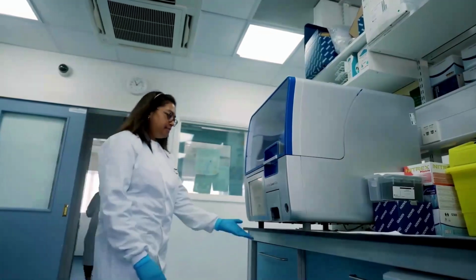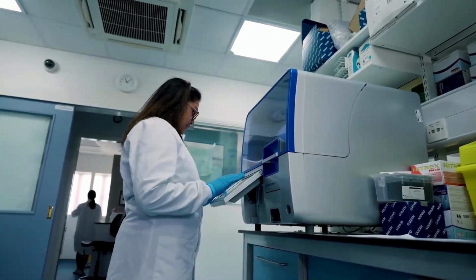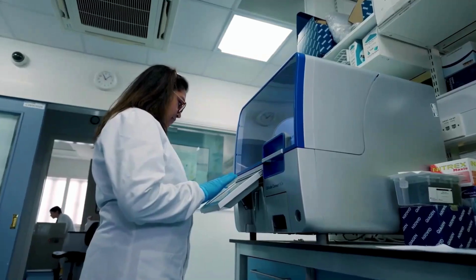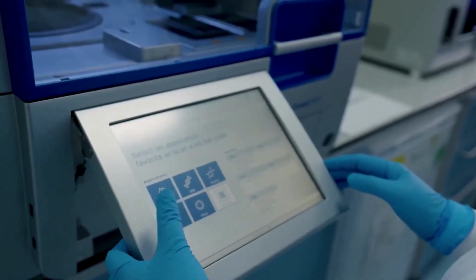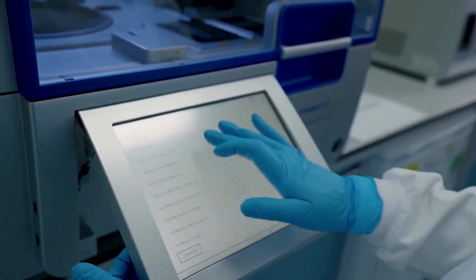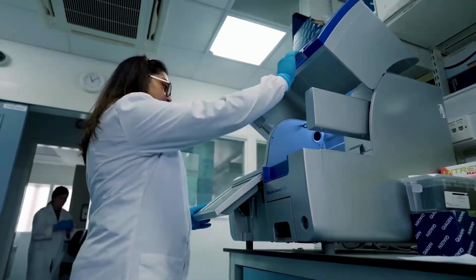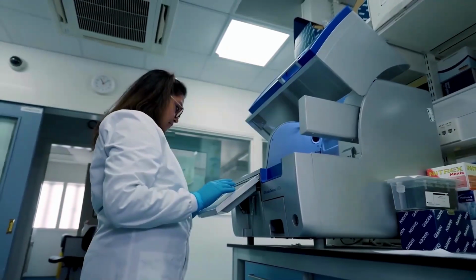We're hoping to be able to sequence on a MiSeq sequencer 8 to 10 individual patients with read depth up to something like 20,000, hoping to get below 1% allele frequency detection. This is still a research project, but at the moment the data is looking promising and we're quite hopeful.